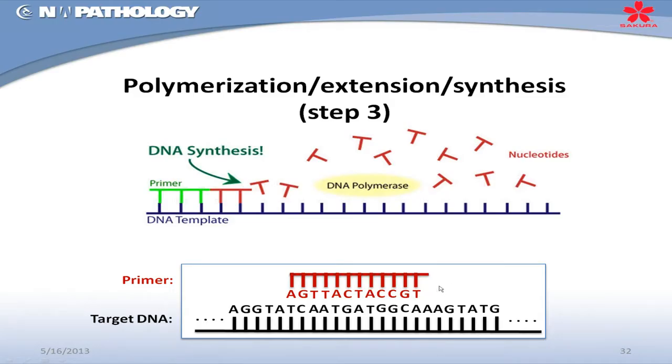When we cool them, in addition to its native molecule that the two strands could find, we've added these primers to the reaction. So since these primers are in great excess over the initial template, after melting the two strands apart, it's more likely that a primer will bind to its target than the target binding to its complementary other strand itself.